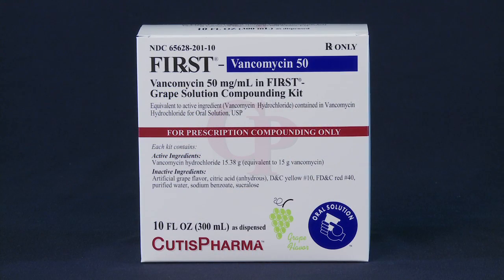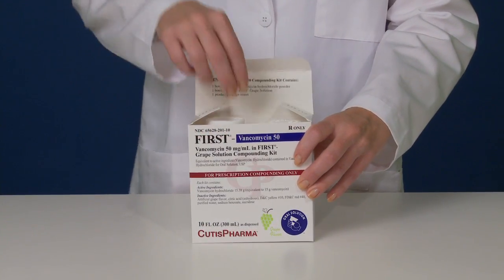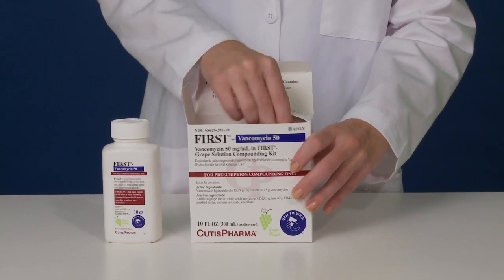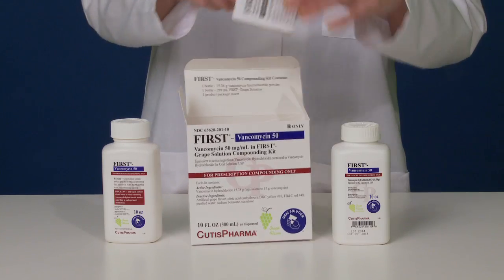For this demonstration, we will compound 10-ounce vancomycin 50, but the procedure is the same for all of the kits. Every ingredient has been pre-weighed or pre-measured, saving you time and supporting accuracy. Begin by opening the box and verifying that all of the components are present.